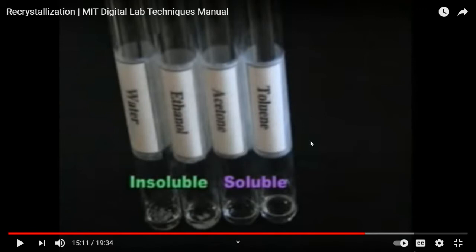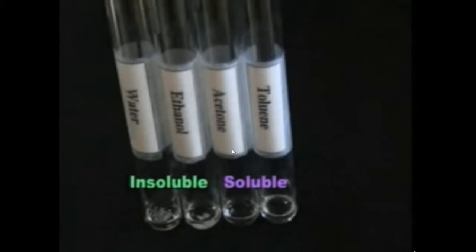So they're using a soluble solvent and an insoluble solvent. It's not the same thing. And then they mix them up, and then they are doing a much better job than a single solvent system. That's what they're saying. Just listen.